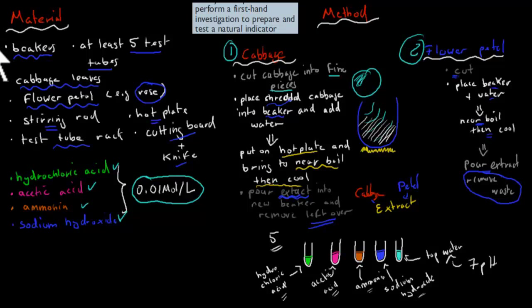Then what we do is put our indicator, our cabbage indicator, into each of them. See what it does in terms of color change. There will be color changes for each of these, or there might not be, but we can use that to estimate what actually happened. After using the cabbage, we use the petal. Rinse out our test tubes, refill them with our acids and bases and tap water, and use the petal indicator by putting them into the beakers and observing any changes.